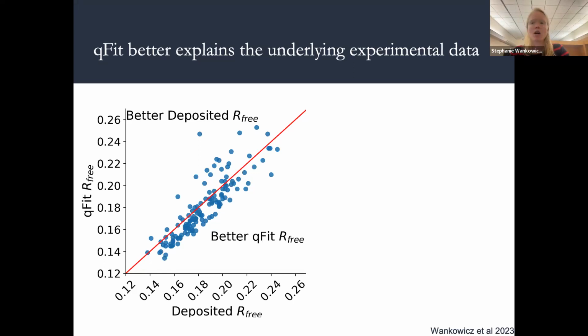And I think, regardless of what kind of science or what kind of engineering you're in, our goal is to always be creating models that are best explaining the data that we have, in whatever capacity you do that. And what this is really telling us is that by modeling in structural ensembles, we are actually explaining the experimental data that we have much better. And our data is trying to tell us that it exists in this structural ensemble. This is what the protein exists in.